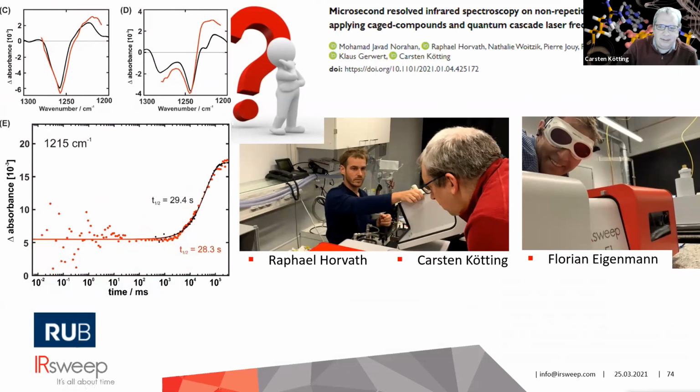I think that's something Florian can answer. That's right. There's always a question of how broad it can go. This was nicely covered by Jérôme Feist. Can we go to 300 or 400 wave numbers? Currently, we already have some results up to 100, measured last year. Jérôme also mentioned that 250 is definitely feasible. Currently, the laser broadness specified at IRsweep is 60 wave numbers.